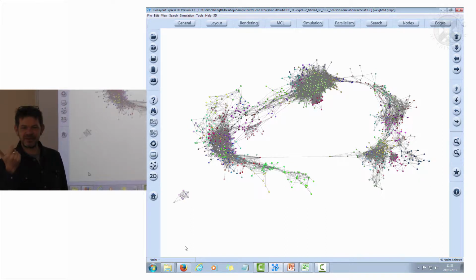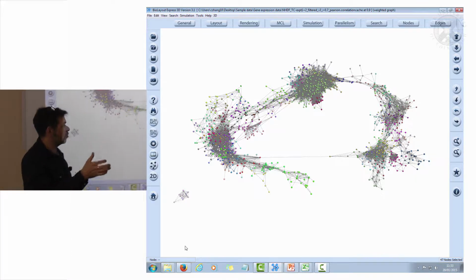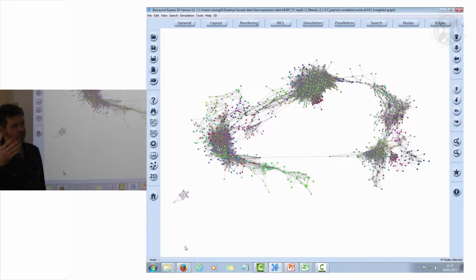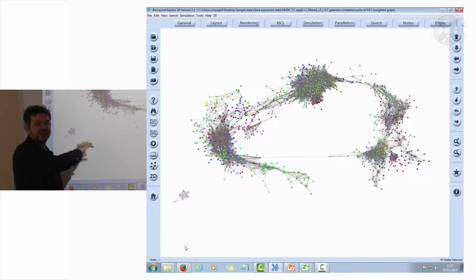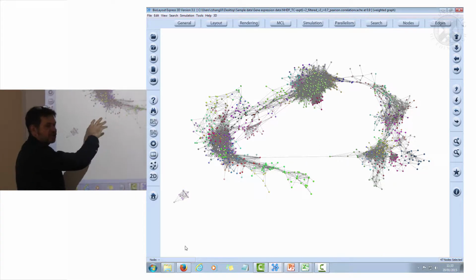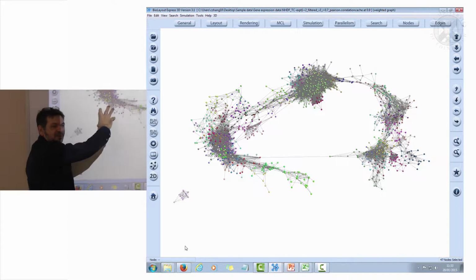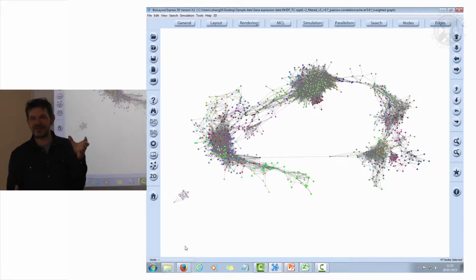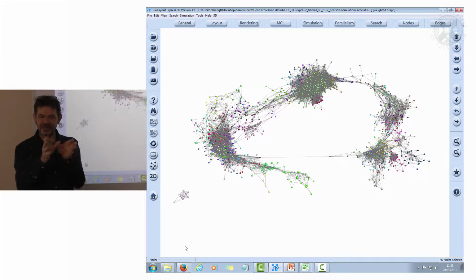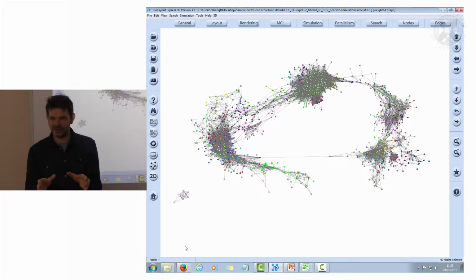So as I mentioned, we ran this as 2 separate experiments. You will find in the raw normalized data that actually there's a difference between experiment 1 and experiment 2. There's a whole bunch of genes which are a lot higher in experiment 1 and lower in experiment 2 and vice versa. This is an artifact of normalization. These genes are not interesting. Their expression pattern is changed purely because the data was different when we started.